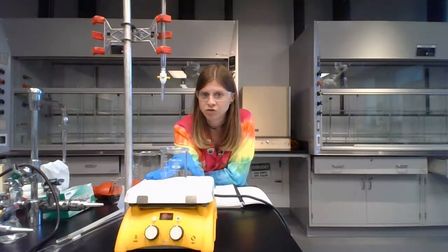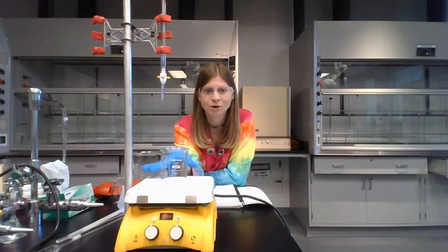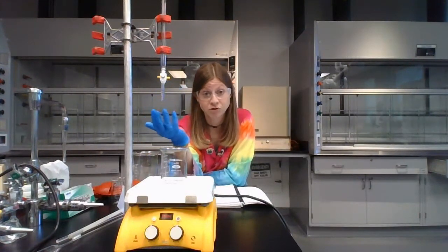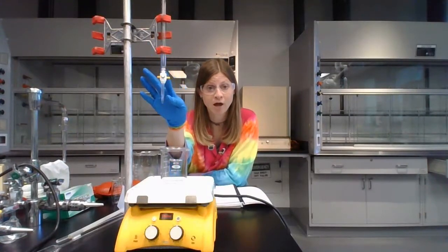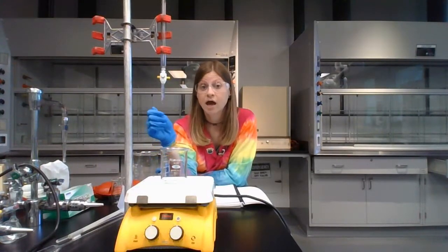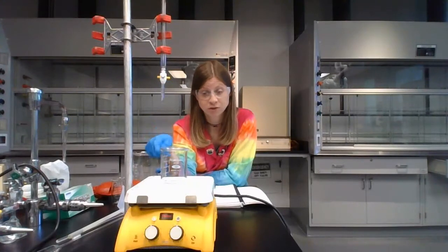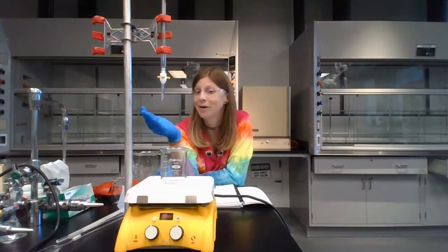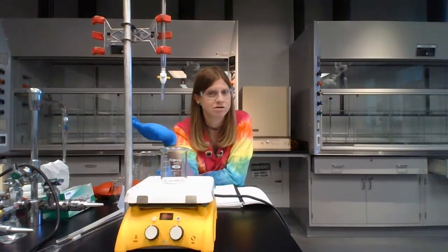If too much sulfuric acid spills onto this, you'll be able to smell sulfur dioxide. It's going to decompose, and we'll be able to smell sulfur. That's bad. We will have to evacuate the room until the fume hoods are able to circulate enough to remove those scents. Potassium permanganate, which will be in the burette, we don't want that to spill onto the hot plate either. Let's say the potassium permanganate spills on the hot plate. That's a spill of potassium permanganate, so you will spray it with oxalic acid and then wipe with a paper towel and rinse with deionized water. I will be happy, or your instructor will be happy, to help you with that sort of thing. But the best case scenario is just to not spill anything on the surface of the hot plate.